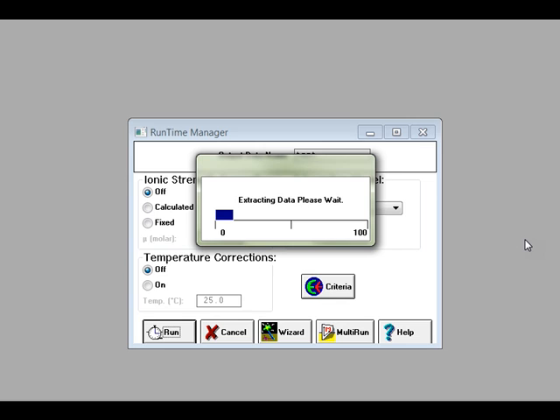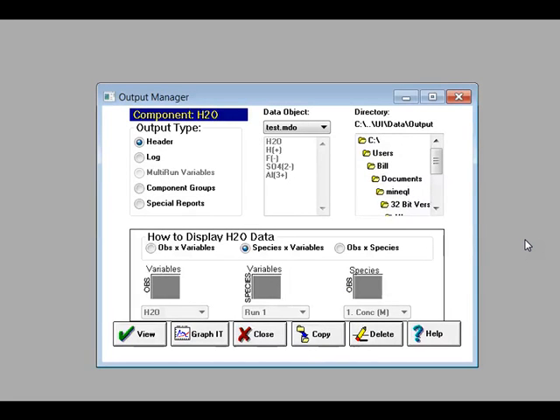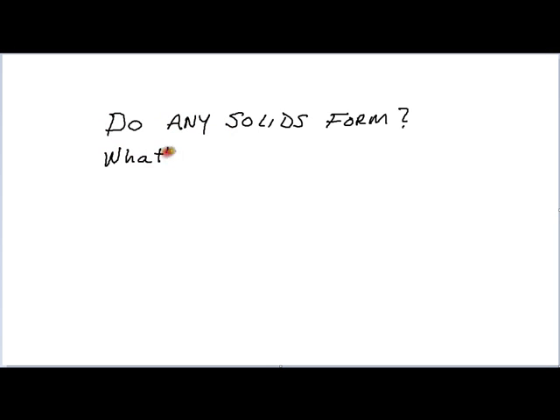MINTEQ will then calculate the distribution of chemical species in your sample and create an output object for you to view. Go to the output manager to answer a wide range of questions about this data.